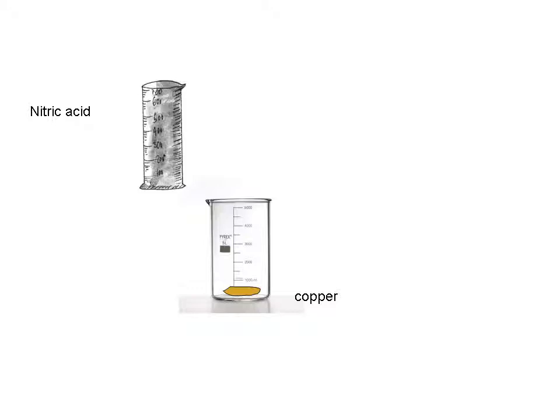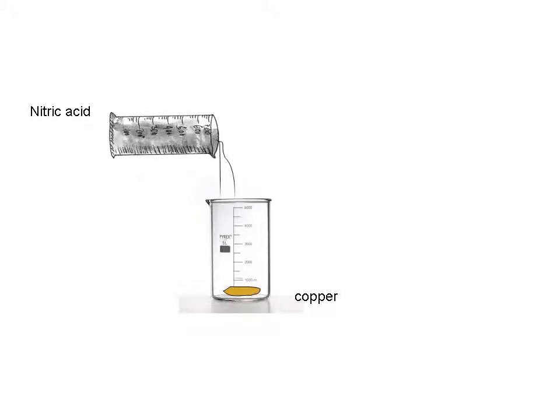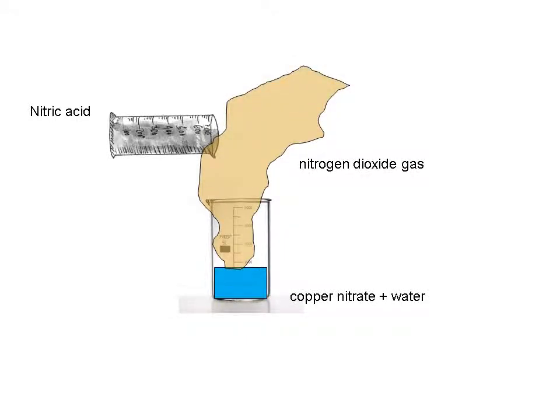We start with a piece of copper which has been pre-weighed and placed in a beaker. To that, we add a solution of nitric acid. As the nitric acid goes into the copper, the solution turns from a colorless solution to blue and a brown gas is released. This is quite toxic, smells a little bit like chlorine and so we have to do this procedure in the fume cupboard.